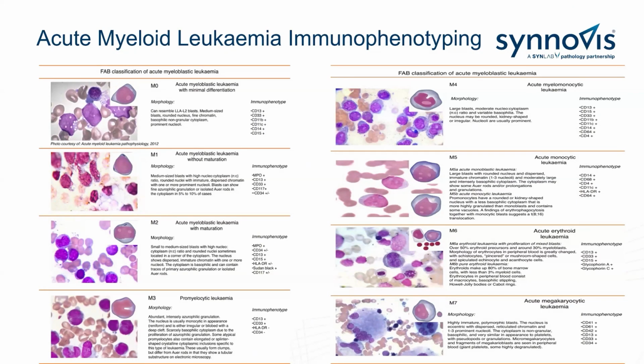Now, I know that that's very difficult for you in Zambia, that you have to send them away overseas and pay per cell marker, etc. You would be more used to seeing the morphology, but Conor's going to go through some flow cases for you now. Thanks, Conor, just to give them background. Absolutely.